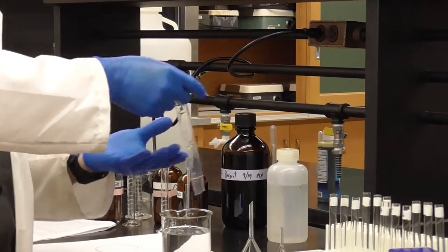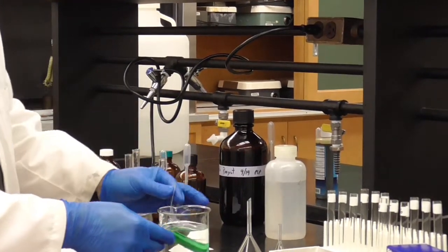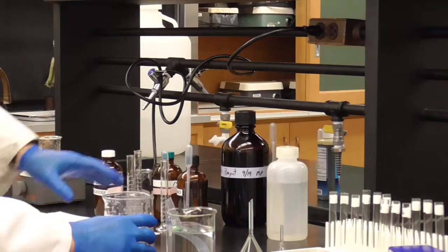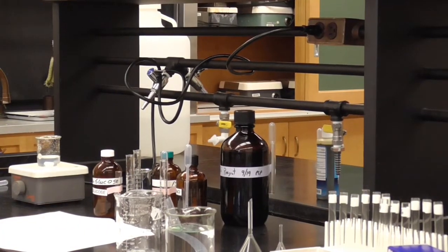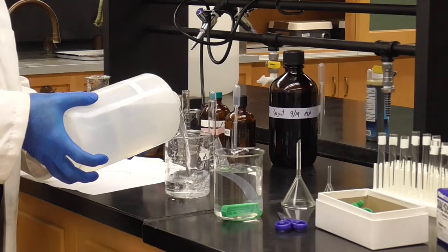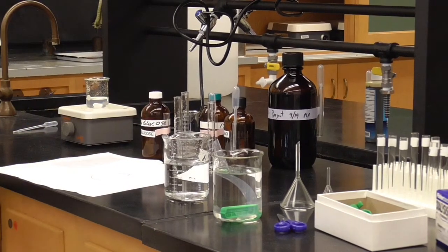Of course, first we got to get our stuff into the dialysis tube. So I'm going to just go and put this back in here so it doesn't dry out quite yet, and go over here and get a second beaker and fill it with DI water, about 2/3 full or so. There we go. There's some DI water, so that it'll be ready to receive our dialysis tubing once we get it filled up with our solution.